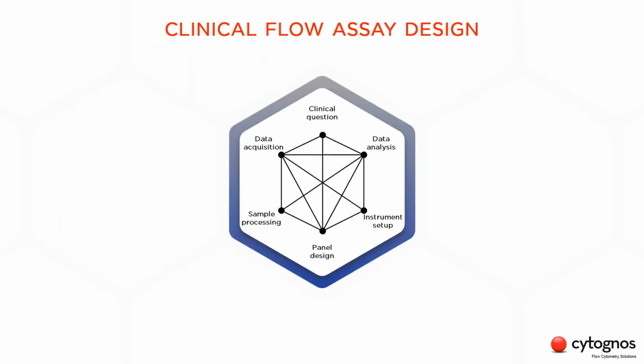Now, before introducing a new test in the lab, we need to carefully design and clinically validate the assay. And to design a new flow test, there are several aspects we need to keep in mind. First of all, the clinical question that we want to answer. And the clinical question is going to determine the panel design, the sample processing protocols, the instrument settings, the data acquisition parameters, and the data analysis strategy.